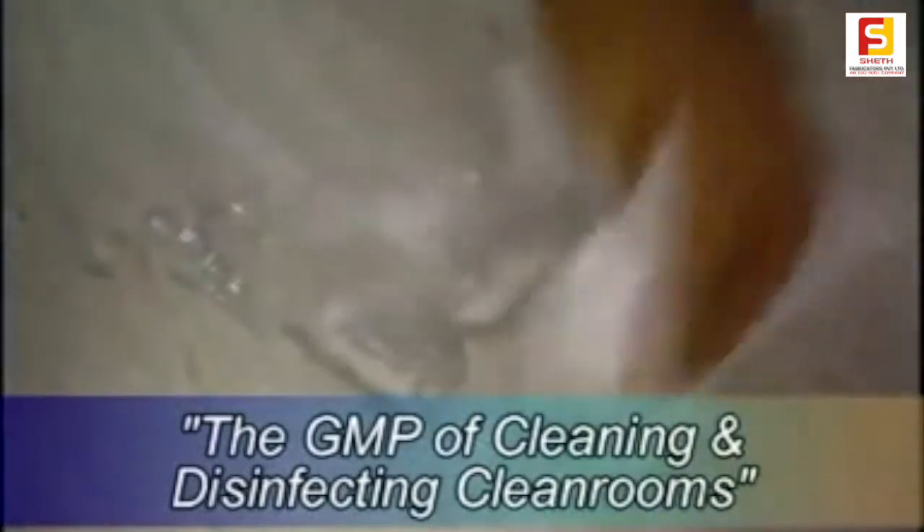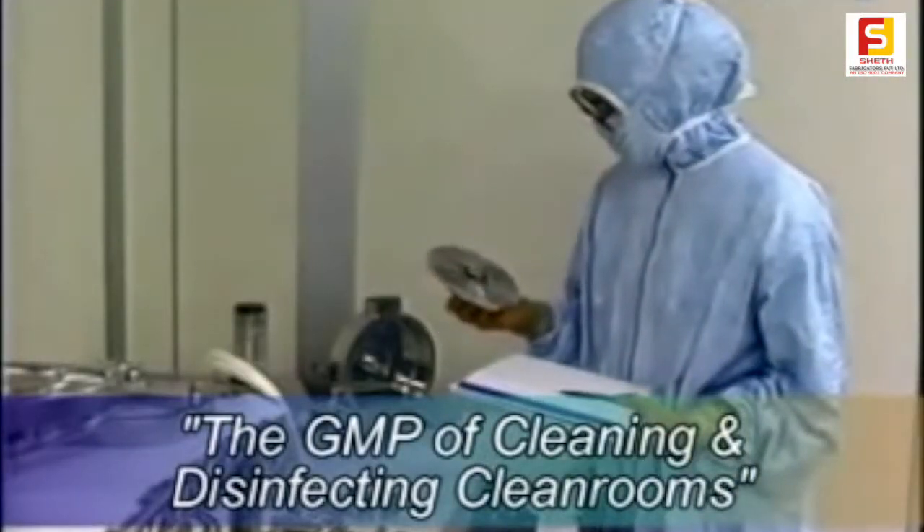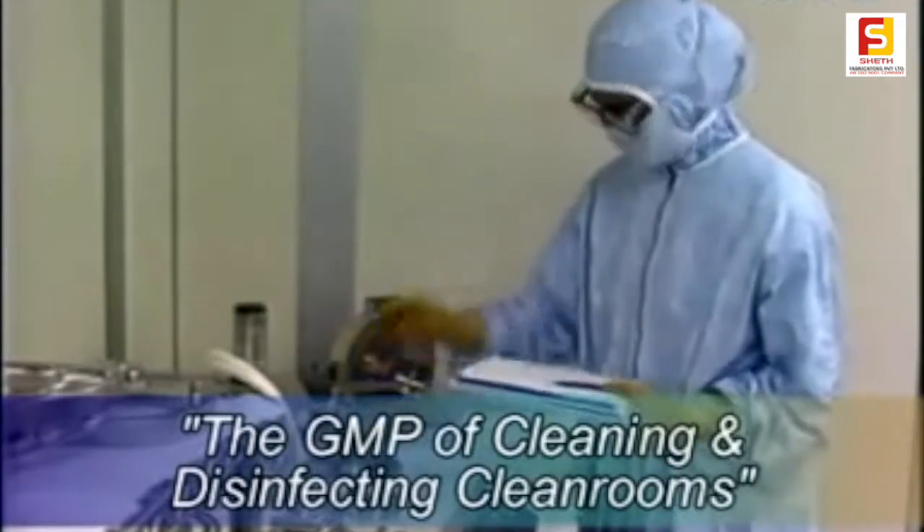The initial clean-up should be performed with slow, deliberate motion. Any signs of deterioration of equipment should be noted on lint-free paper and the supervisor informed.